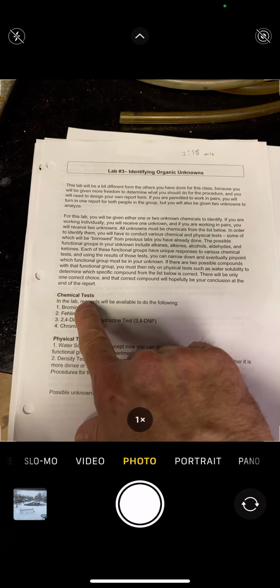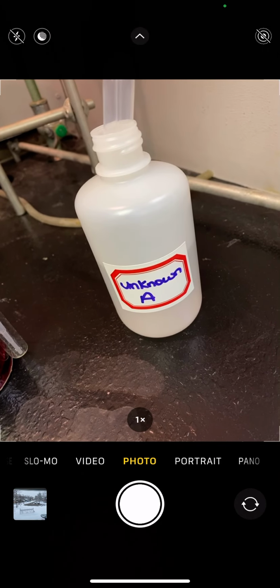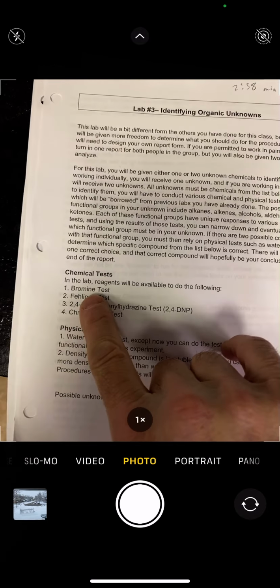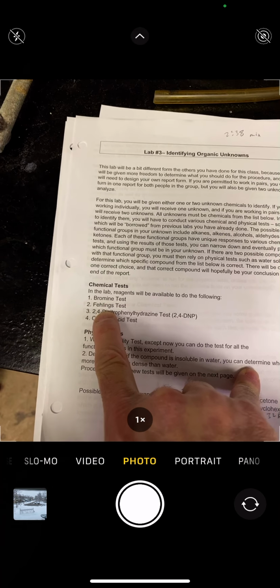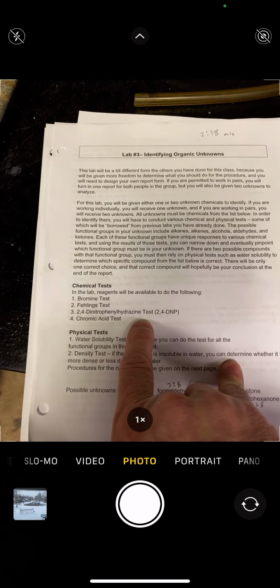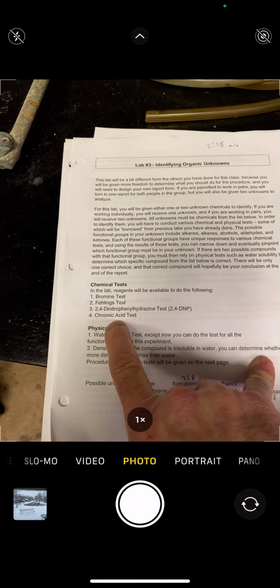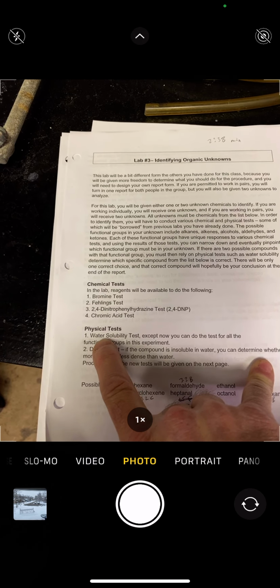So what I'm going to do is take you through these tests myself with unknown A. So you all have unknown A. We're all going to use the same one since I'm doing the lab. I did post videos above this video, much better videos than mine, that show the bromine test and what's positive, Fehling's, 2,4-dinitrophenylhydrazine, which is called 2,4-DNP for short, and the chromic acid test. I didn't post one for water solubility, but we'll talk about that and try it.